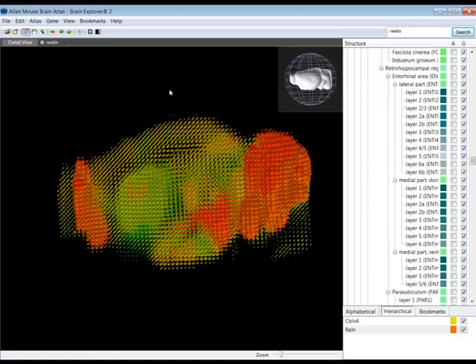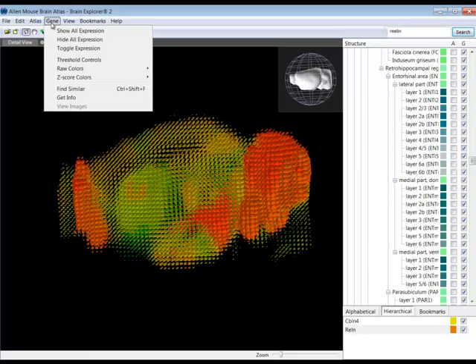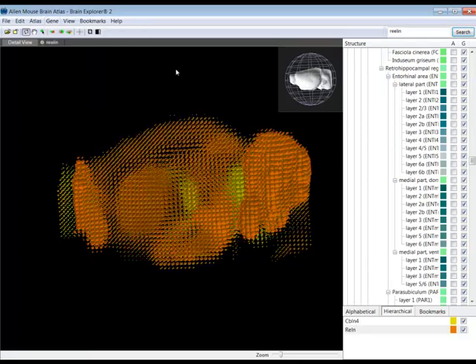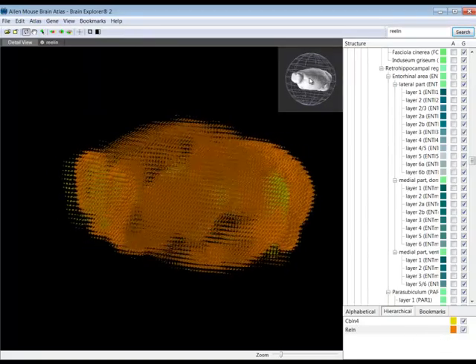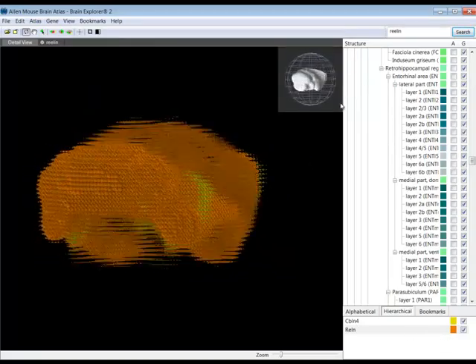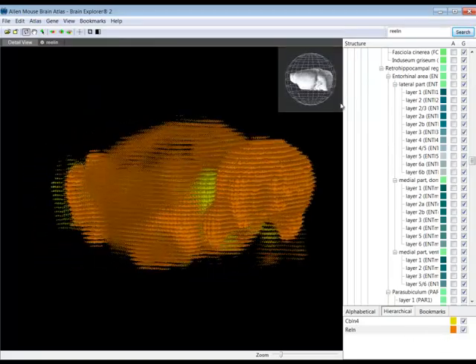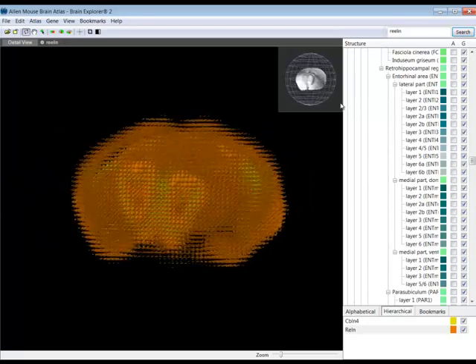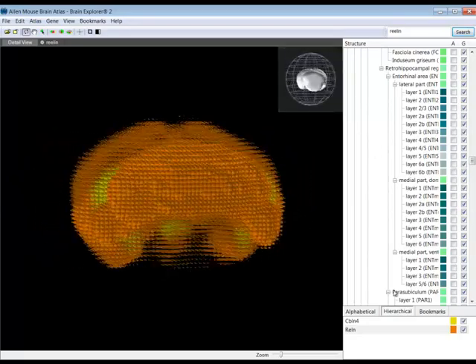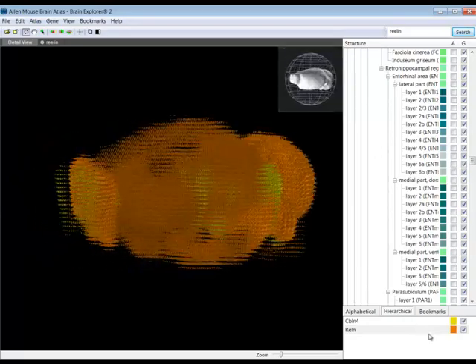You're now looking at the expression energy of both genes. To distinguish the expression patterns of each individual gene, from the Gene drop-down menu, select Raw Colors, then select User Defined. Now, CBLN4 is shown in yellow, and Relin is shown in orange.